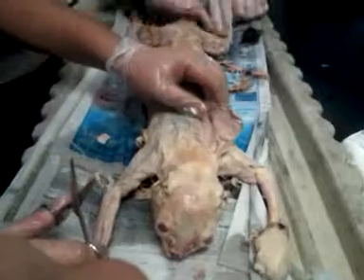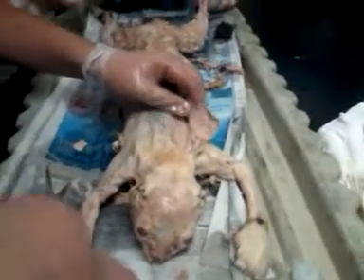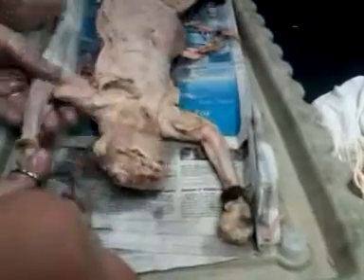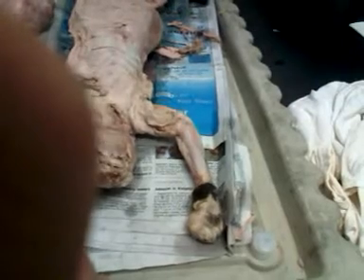He cut that. Is that... That's part of your hamstring. Oh, you messed up. But it's better if I turn it over. Can I turn it over for a minute? Have y'all done the hands yet? Work on it. Okay, this is so easy. Watch this. I'm going to cut the Achilles tendon. Are you ready? Yes. Okay, Achilles tendon has been cut.